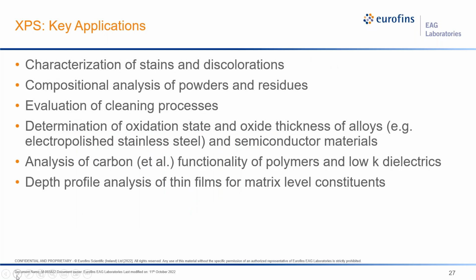Key applications of XPS include characterizations of stains and discolorations. We can do compositional analysis of powders and residues. We often evaluate cleaning processes. We can determine oxidation state and other chemical states of different elements. Like I mentioned before, we analyze carbon functionality.